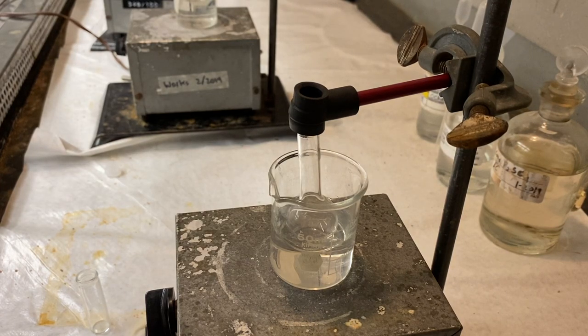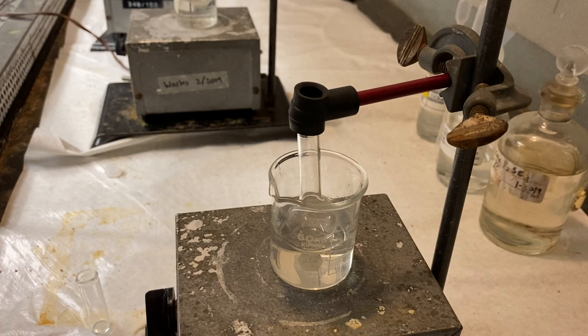Today we're doing the nitration of bromobenzene, which is an example of electrophilic aromatic substitution. To do this we're going to need to work with concentrated acids, so it's really important that we wear our safety goggles.